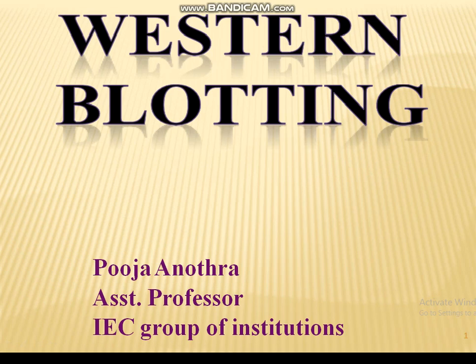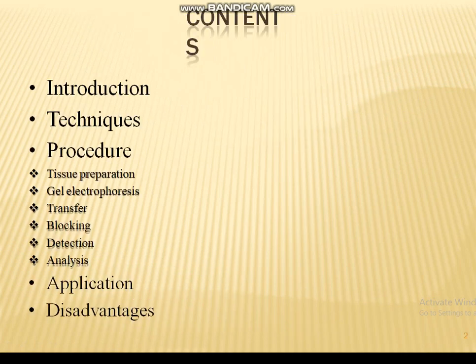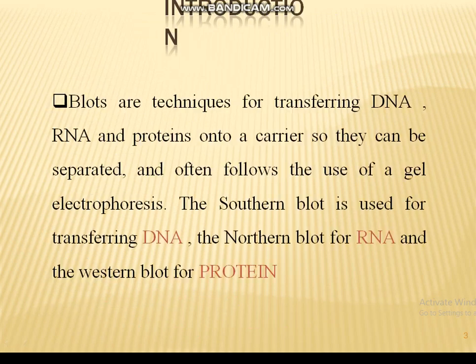Today, I will talk about Western blotting technique. In my previous video, I already explained the blotting technique, Southern blotting and Northern blotting. Today, I will explain Western blotting technique. In this video, I will be covering introduction, techniques, procedure, application, and disadvantages of Western blotting technique.